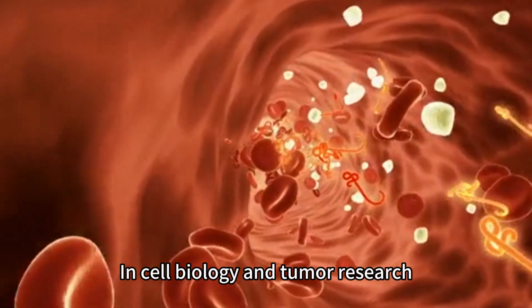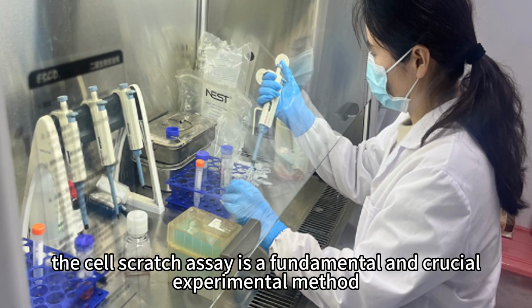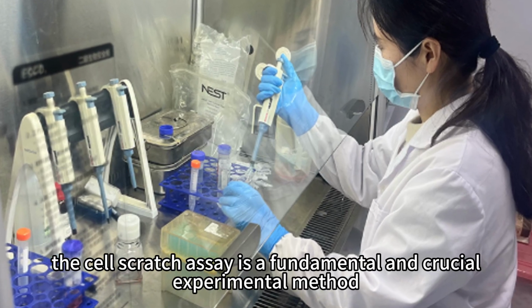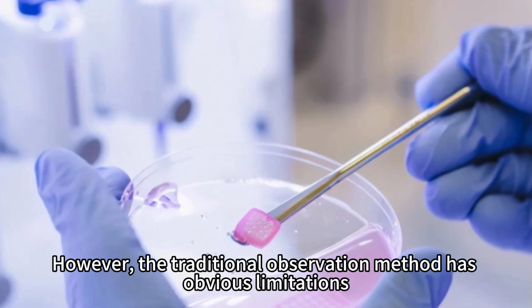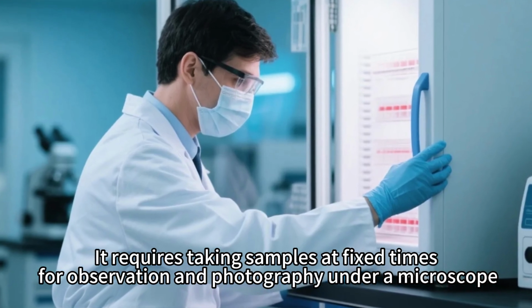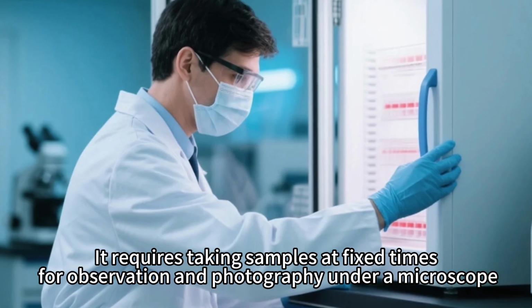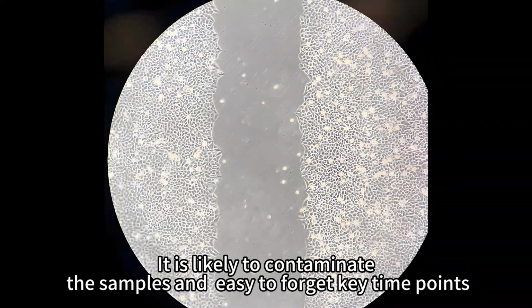In cell biology and tumor research, the cell scratch assay is a fundamental and crucial experimental method. However, the traditional observation method has obvious limitations. It requires taking samples at fixed times for observation and photography under a microscope. It is likely to contaminate the samples and easy to forget key time points.